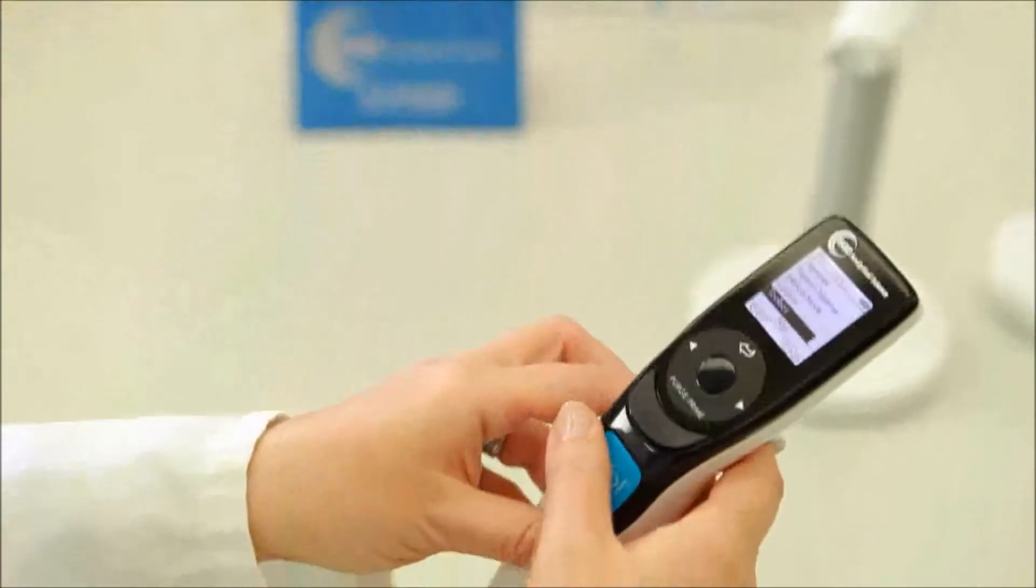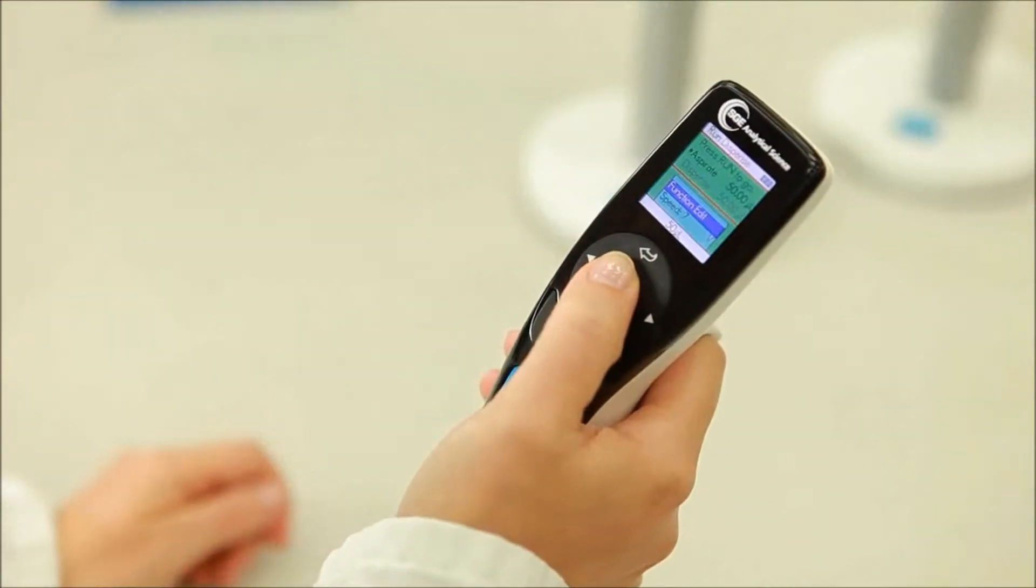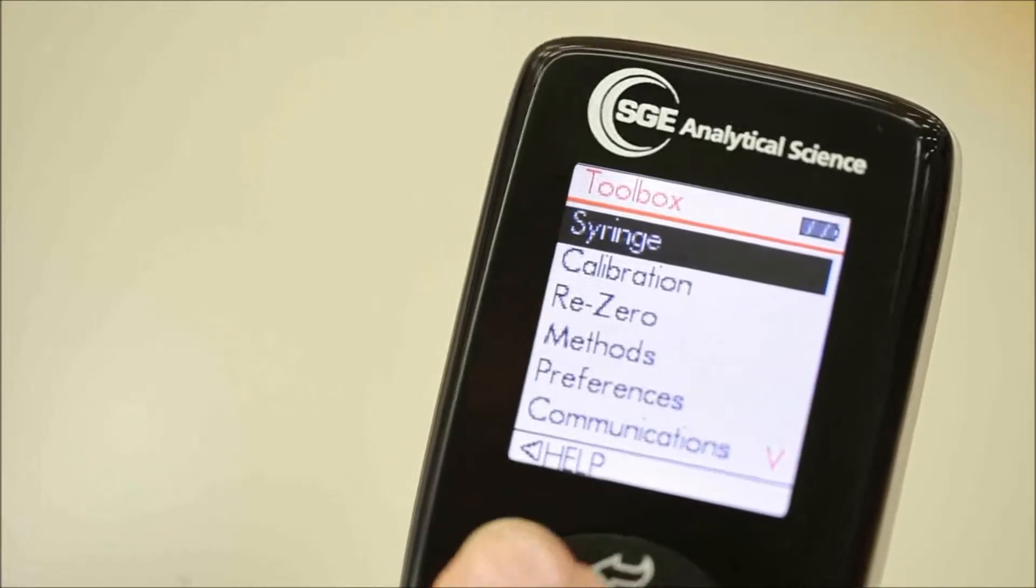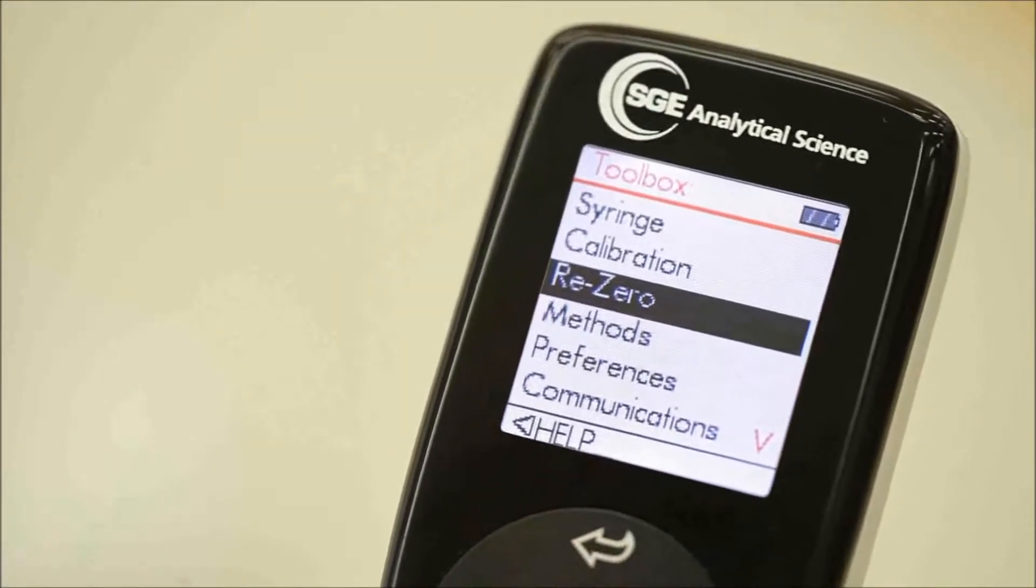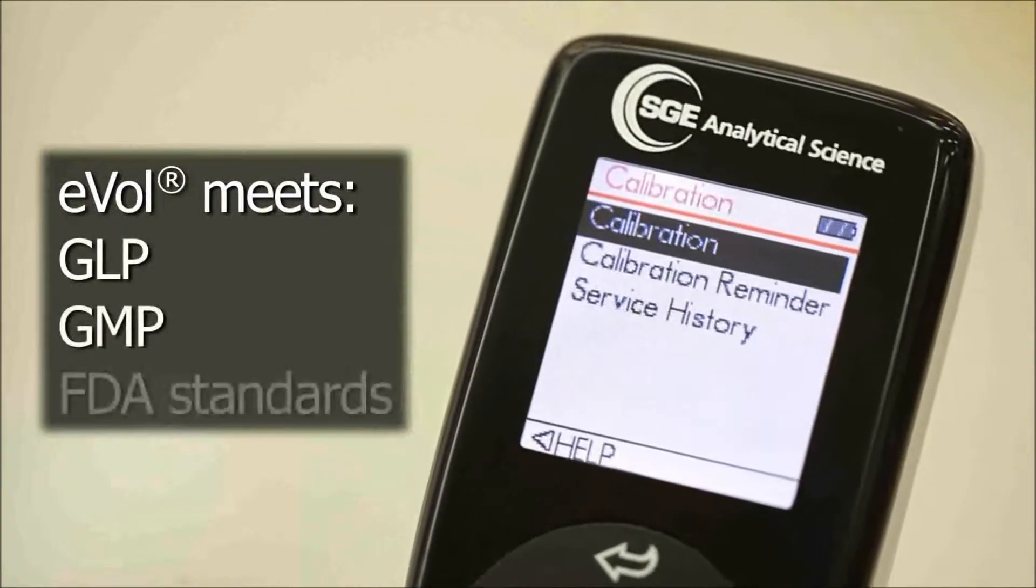The device is ergonomic, comfortable, easy to use and easy to calibrate. In fact, calibration factors are saved for each syringe, enabling laboratories to comply with stringent global laboratory standards.